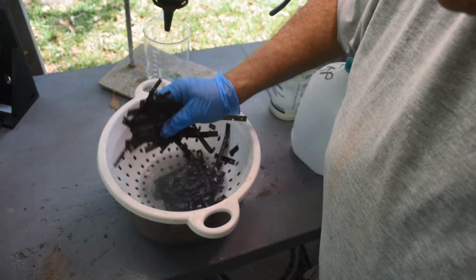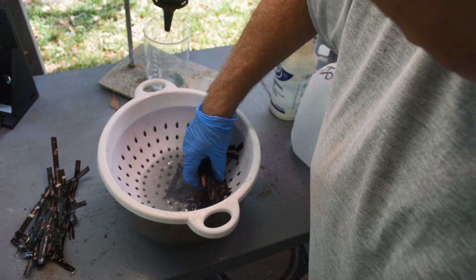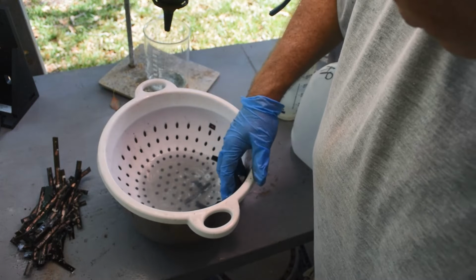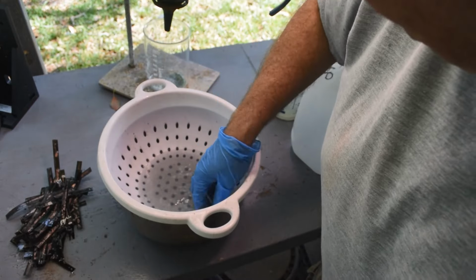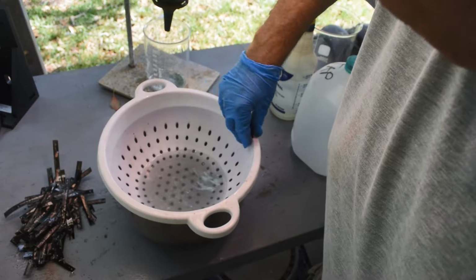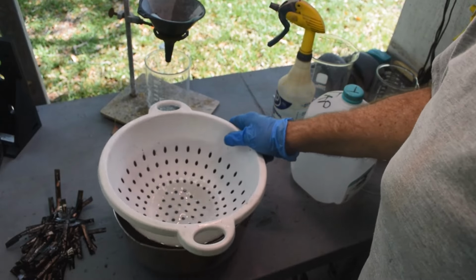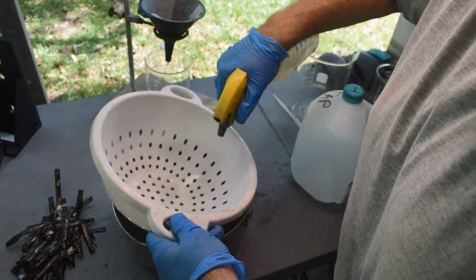Let me pull these out. Yeah, I would say we got the bulk of the palladium. There might be just a little bit here and there. We got the bulk of it. Between what's in this filter back here, the first filtration, and what's in here, we definitely got the bulk of the palladium.